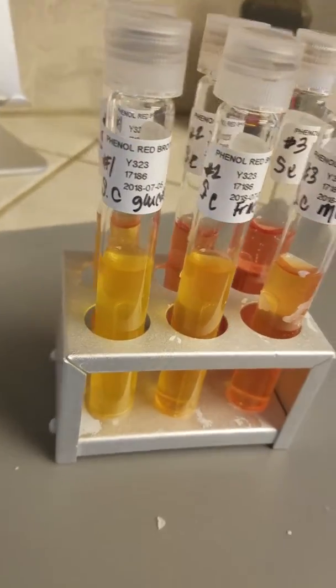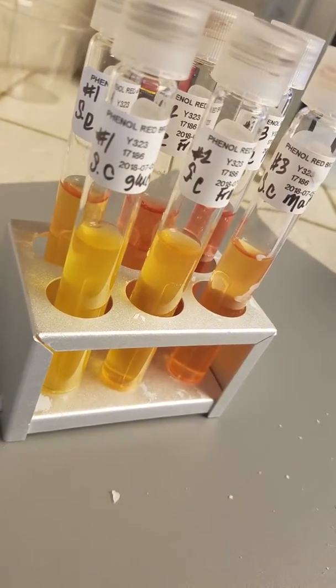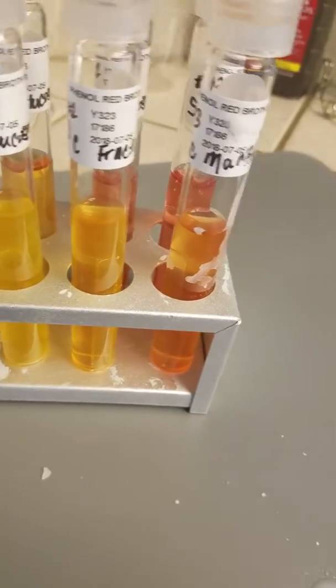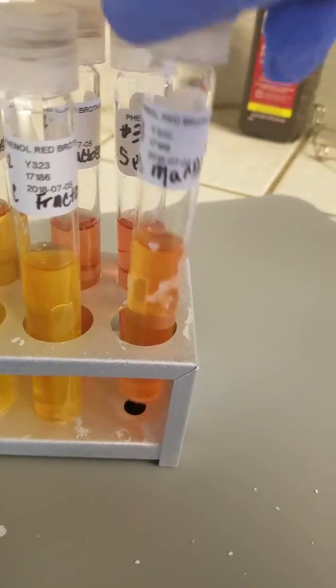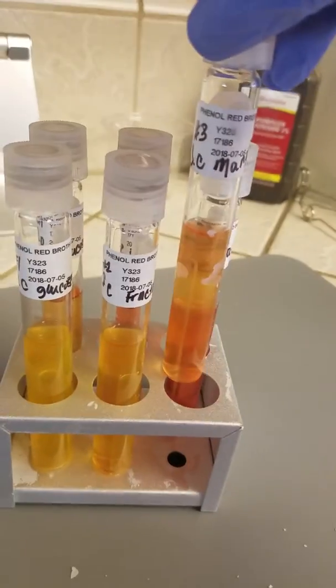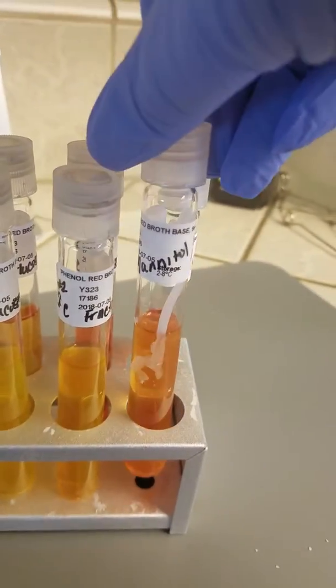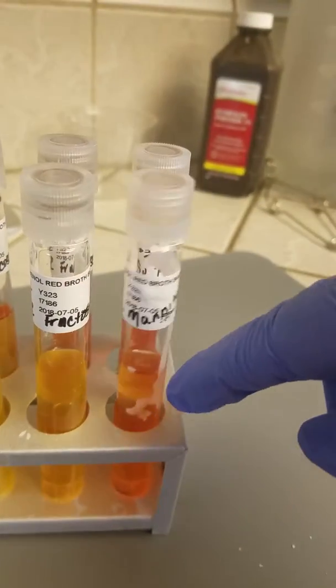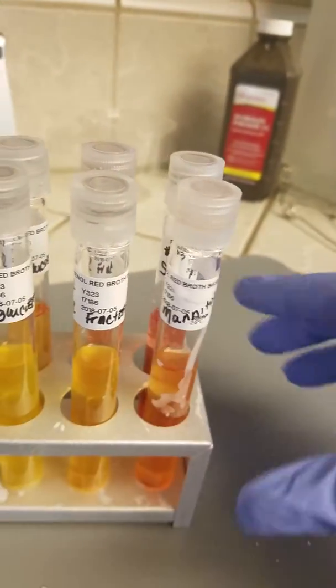So this front row is my yeast. You can see that most of them are all of a yellow color. That right there on the bottle, that's some wax from the candle.